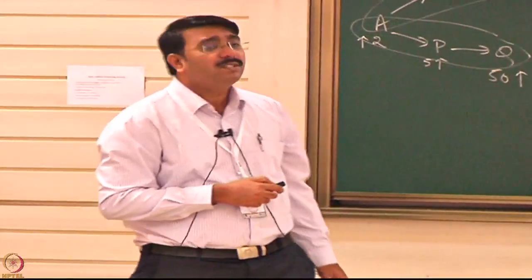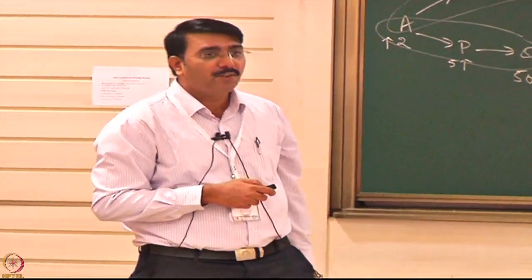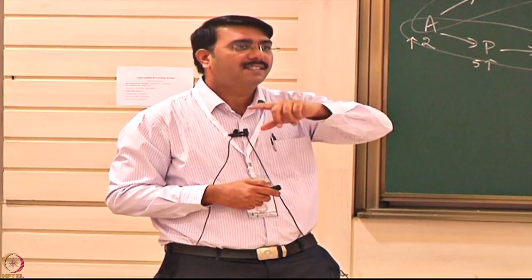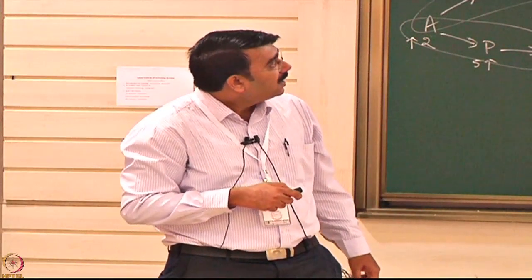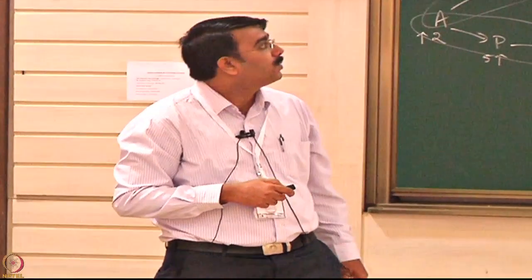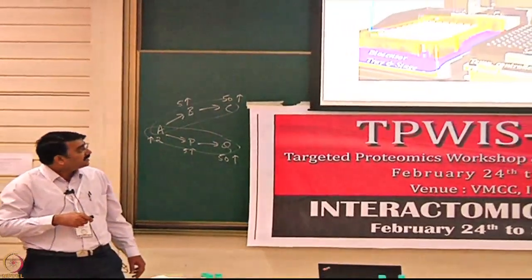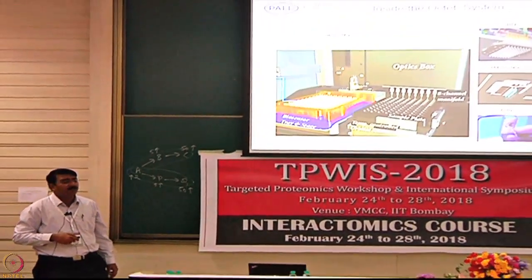When it comes to high throughput, we have different channels. In SPR, there are four-channel and two-channel instruments. In a four-channel instrument, you can pass three analytes and one acts as a reference. Here we have an instrument with eight channels: eight interactions you can measure simultaneously. That's where the throughput comes. We have a 96-channel instrument: 96 interactions you can perform in one go. And we have a 16-channel one: 16 interactions in one go. We have a single channel also, and two channel.